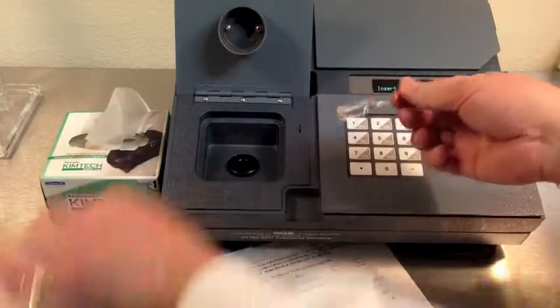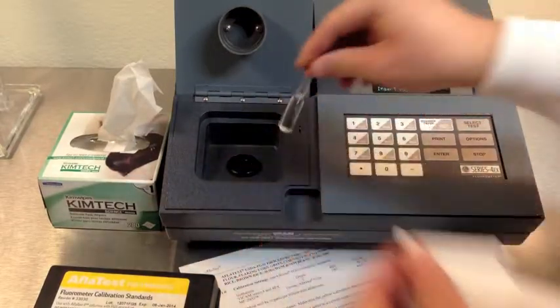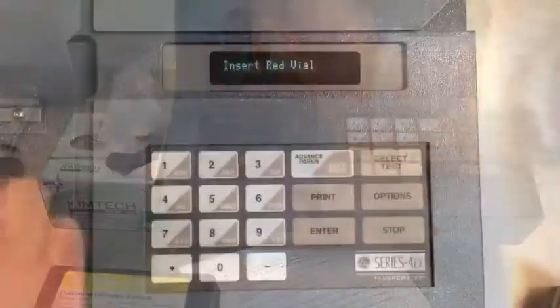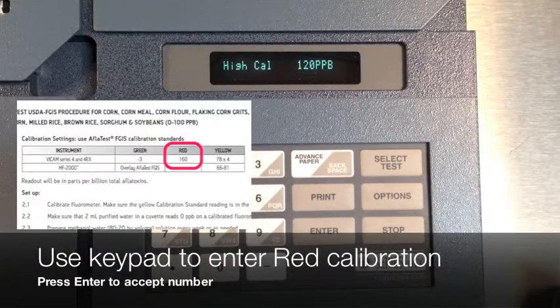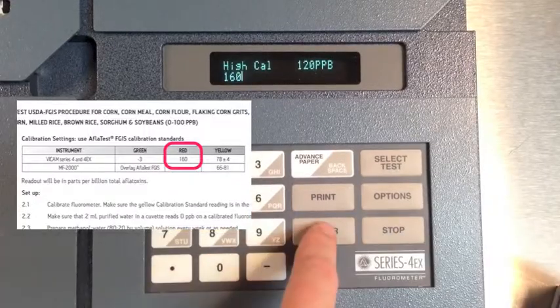When prompted, insert the red vial. Always clean anything going into the fluorometer with a wipe before inserting. Use the keypad to enter the current calibration settings from the AFLITEST procedures manual. Press enter to accept.